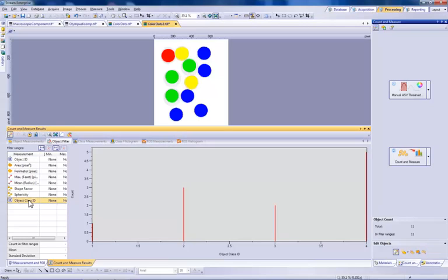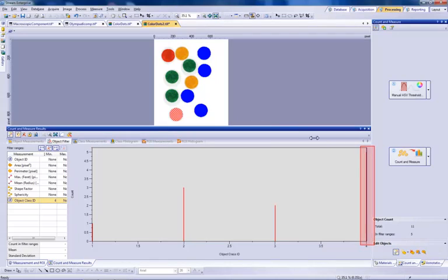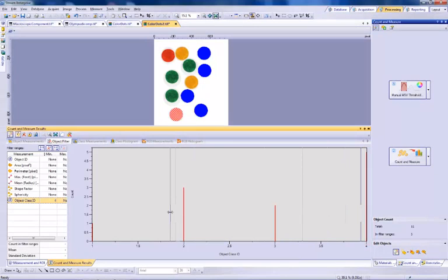If we want to filter by a lower value, we can select Minimum Value button at the top. Now select the object of our minimum value to filter by. This will create a line adjuster in the histogram tool window that we can then drag to any point we wish to adjust the minimum filter value. If we move the slider to 1.5, which is between class or phase 1 and 2, we will see that the filter has removed the objects in class or phase number 1.